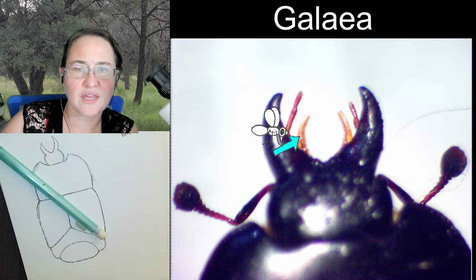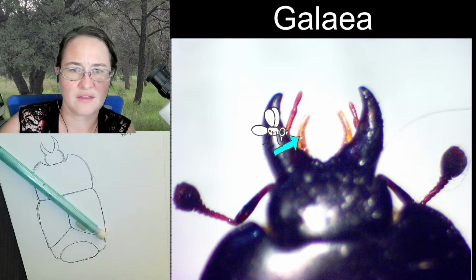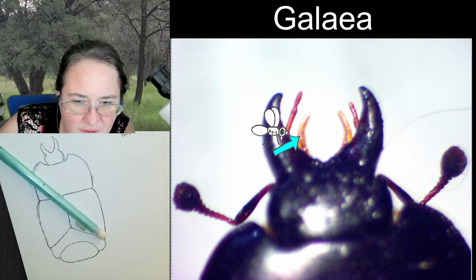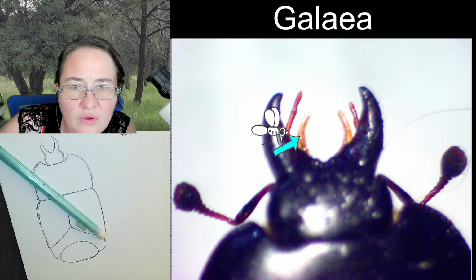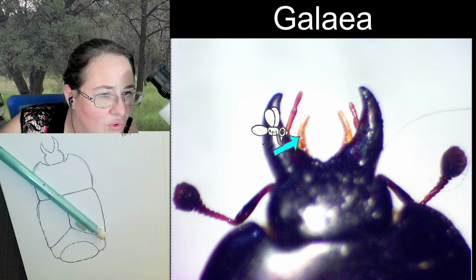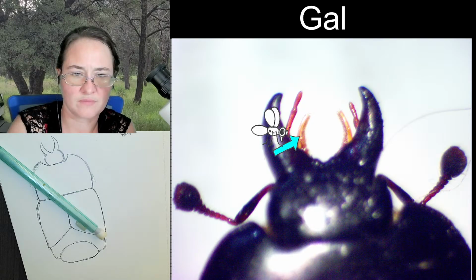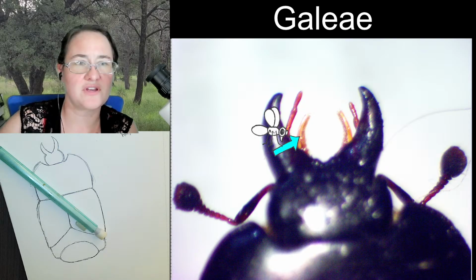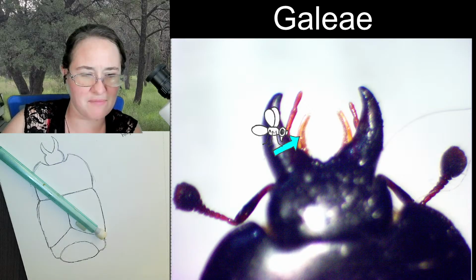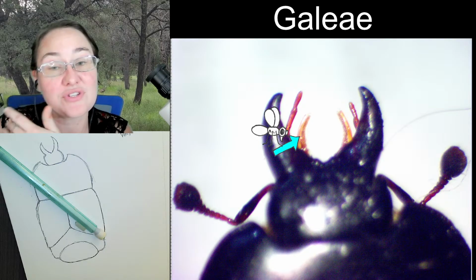It is E-A-E. Sometimes I get my letters mixed up. So, that inside, those are the galeae.